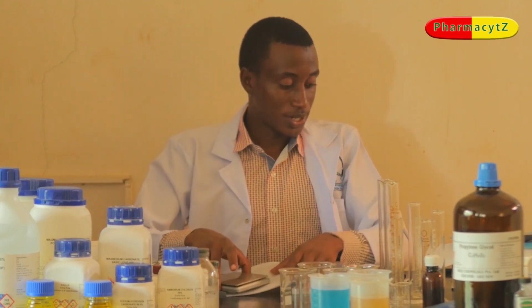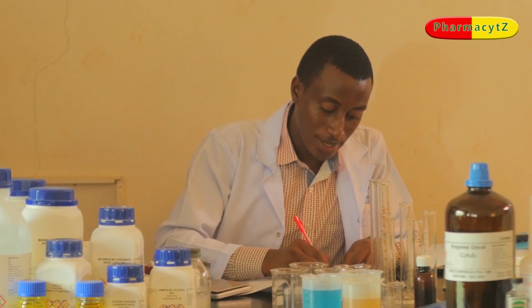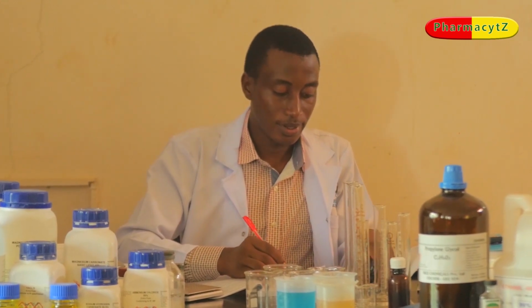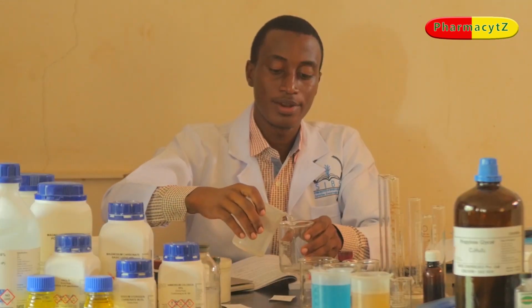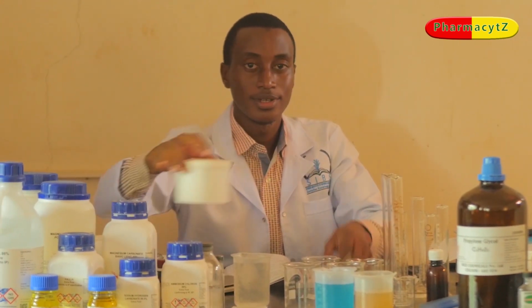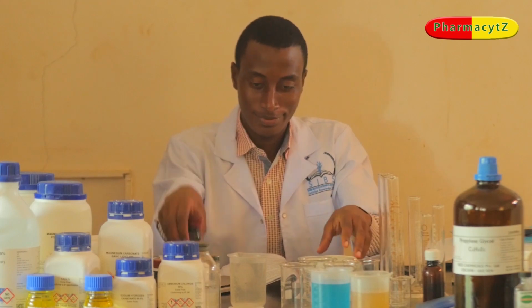For the matter of demonstration here, I will label my ingredients. I have purified water here, and I have iodine, and I have potassium iodide. This is purified water, and I have potassium iodide here with me, as well as iodine crystals.